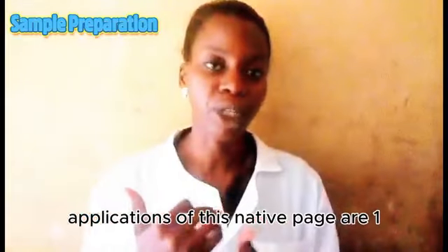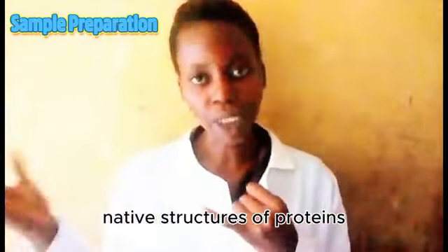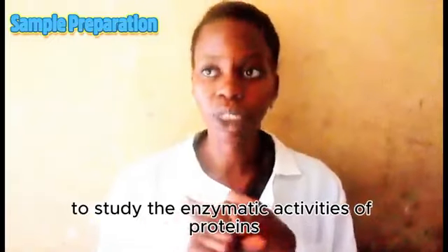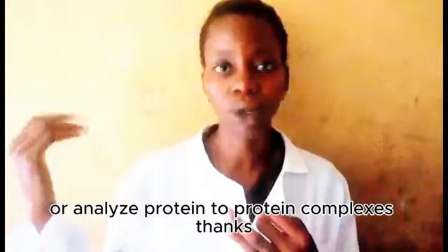Applications of this native PAGE are: 1. It is used to study the native structures of proteins. Secondly, it is also used to study the enzymatic activities of proteins or analyze protein-to-protein complexes.